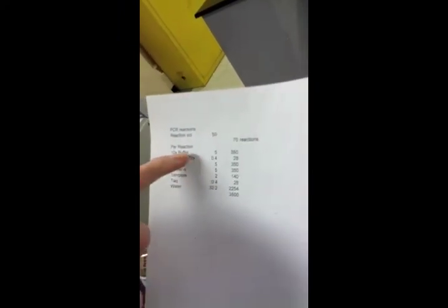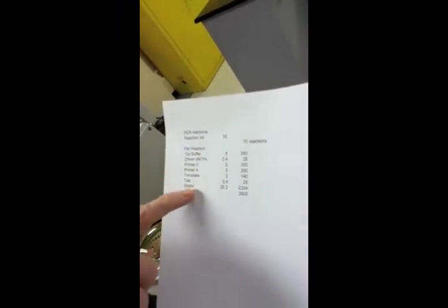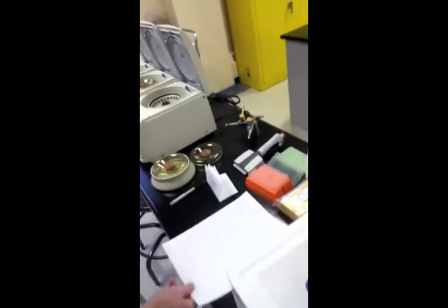Each of those has to be in a particular concentration, so we have worked out for each reaction, our reaction volume is going to be 50 microliters, and so we'll have each of these reagents in a particular proportion. Now we have 65 reactions or so, but I'm just bumping it up to 70 to make sure there will be enough solution.